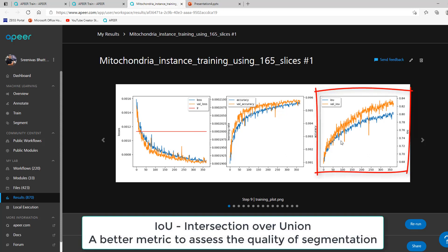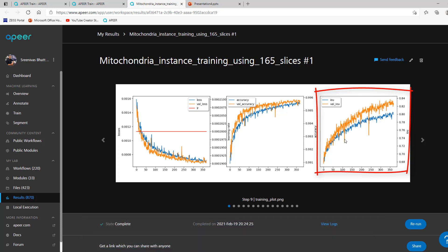IOU, which stands for intersection over union, is recommended to better assess the quality of semantic or instance segmentation. Similar to accuracy, IOU is expected to trend upwards as a function of the number of epochs.